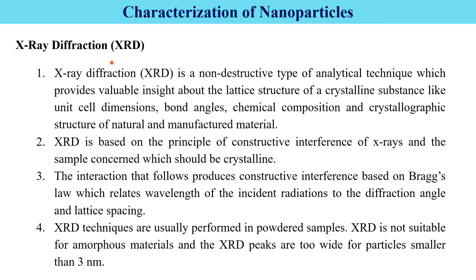X-ray diffraction. X-ray diffraction is a non-destructive analytical technique which provides valuable insight about the lattice structure of the crystalline substance, like unit cell dimensions, bond angles, chemical composition, and crystallographic structure of natural and manufactured material.